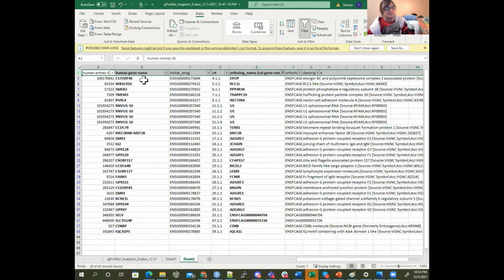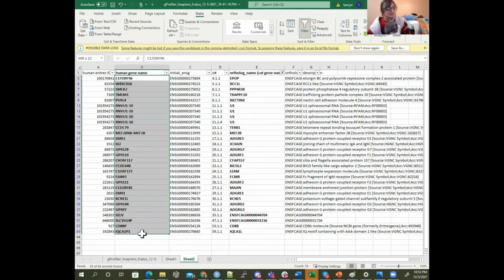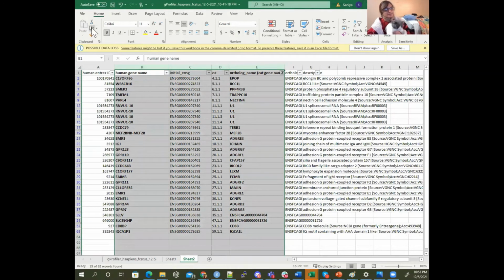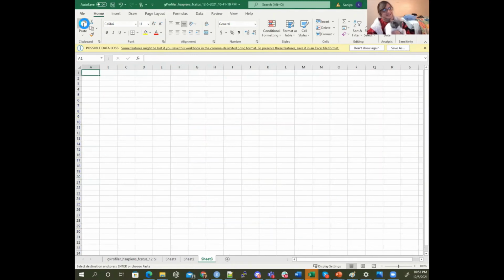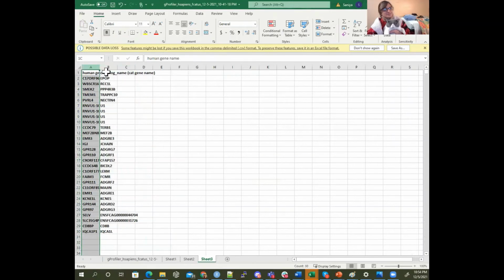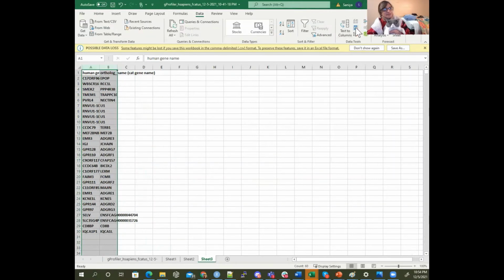And then we have this list of, out of those 59 that we had, okay, we have some repeats here. So we can see that this gene maps to many of them. Out of the 59, let's see which ones map properly, so that we can see how many I had in common with you guys. So I'm going to remove the duplicates and let's see how many I had in common.